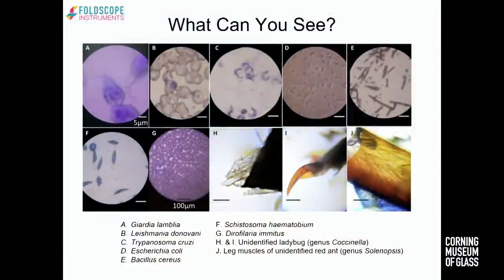And I can show you some of the images that were taken with the 2000X. Go way back now. Some of the bacteria images here, these five are all taken with the 2000X lens. So we can get pretty decent resolution still with that lens, without a ton of aberration.